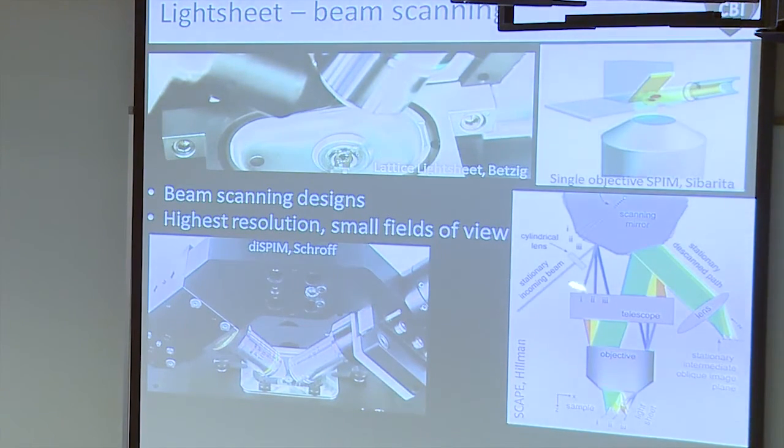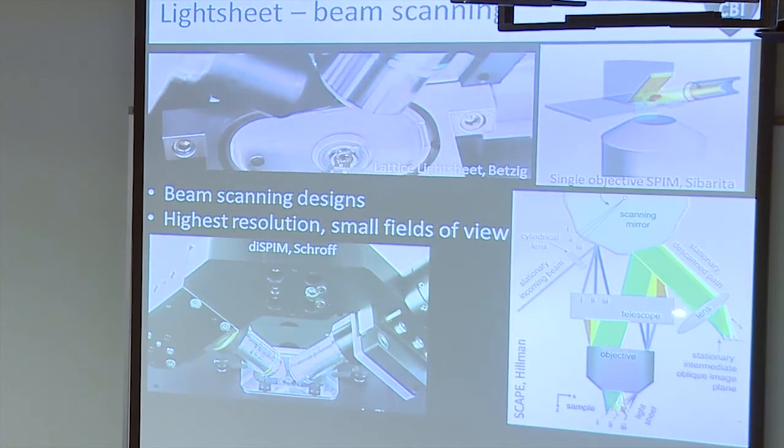They've changed this design a little bit where they put a dichroic mirror in here so that instead of just collecting the light from one half of the objective, they collect all of the light. So they get a little higher resolution and send it over to a camera. So this is just a little light sheet that comes out of one side of the objective, walks across your sample. They collect that fluorescence onto a camera and build up a 3D image.